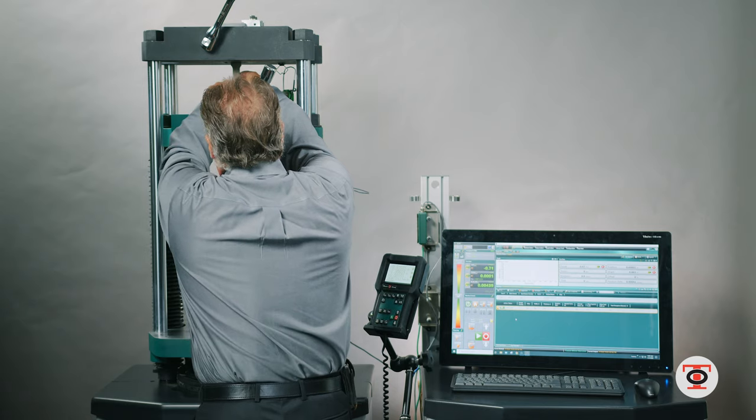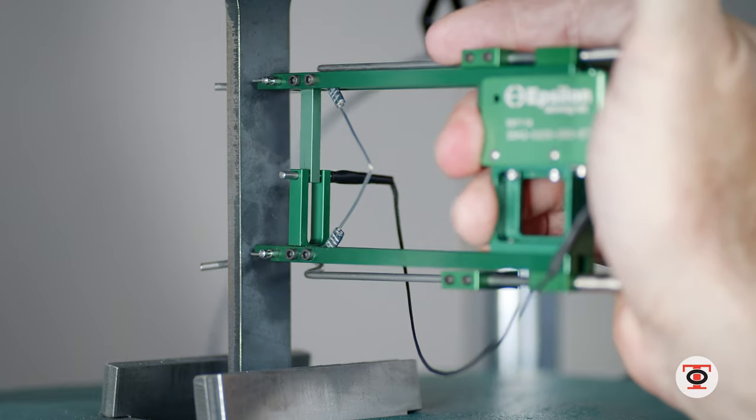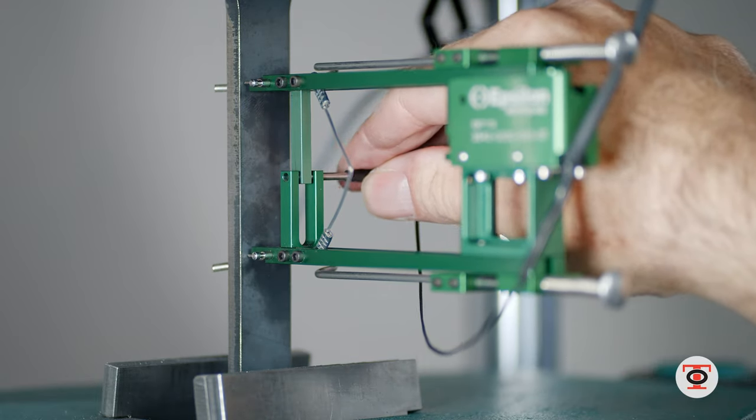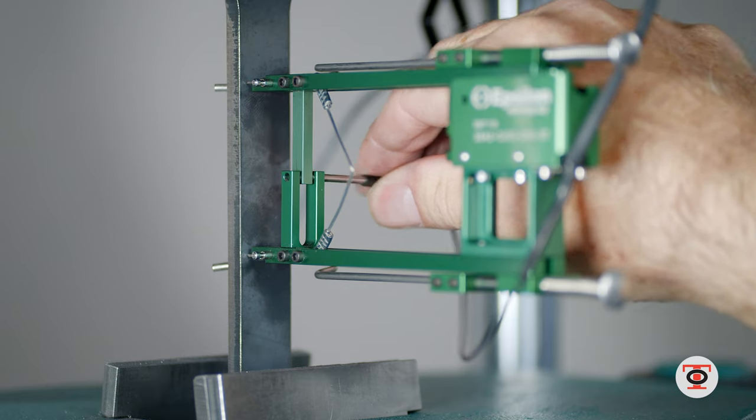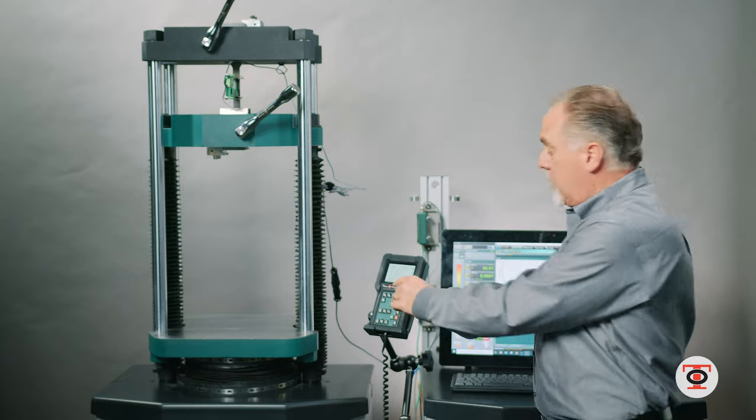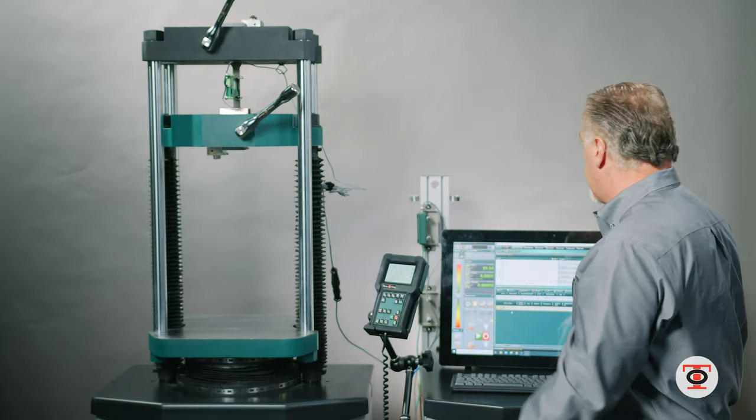I'm now going to put the clip-on extensometer on. Make sure that it's centered top to bottom and in the center of the specimen if possible, and then I will pull the pin, the zero pin, to get ready to start the test. I can zero the instrument from the pro term or I can zero it from the software.